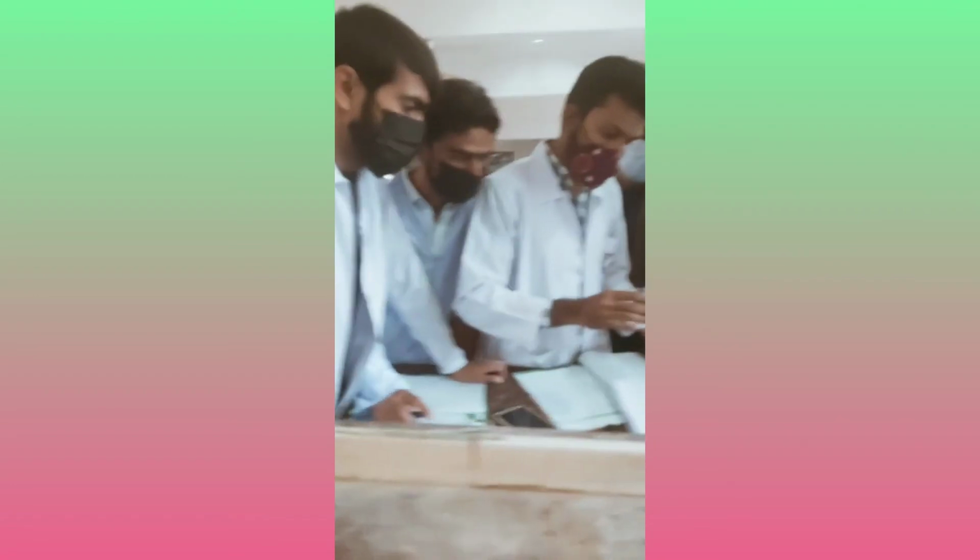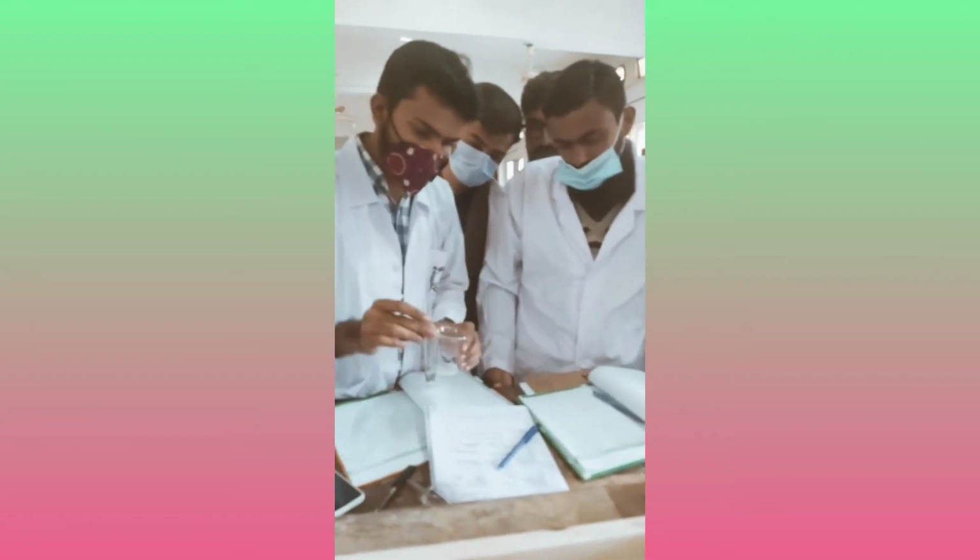Girls are doing the litmus test. So that's it. Dissolve हो गया सही से? Yes. हाँ, that हो रहा. Yes, ma'am, it is an acid. Show me. Yeah. Blue to red. Yes, so that's it. Okay, it is an acid. Record your result. Record your findings. Boys are also doing it. Yes. So you are doing the litmus test? Yes. Okay. Great.